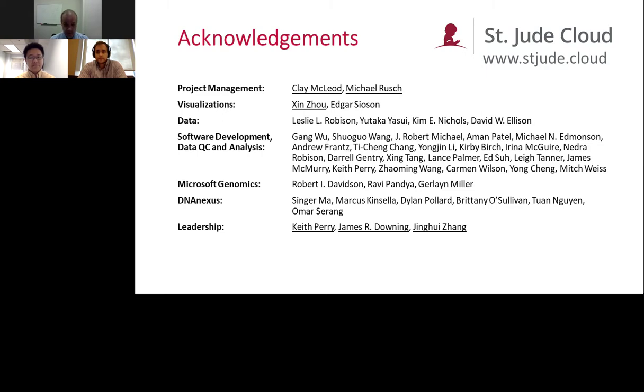I also mentioned that we are going to produce a tool that can find mutational spectra from whole genome sequencing data. And there have been some really interesting insights from leukemia, for example. There's a signature of UV light-induced DNA damage in B-cell leukemias that we don't really understand why, but you can find it using this mutational signatures tool.